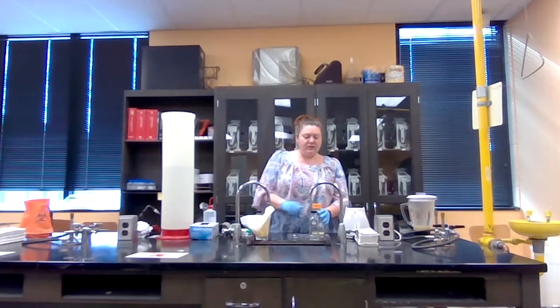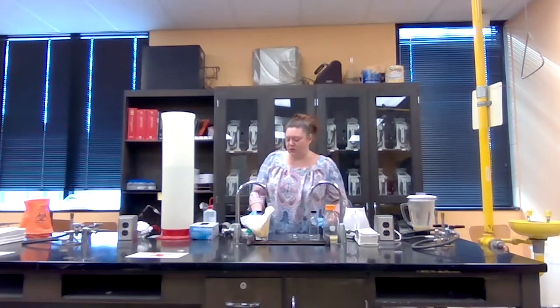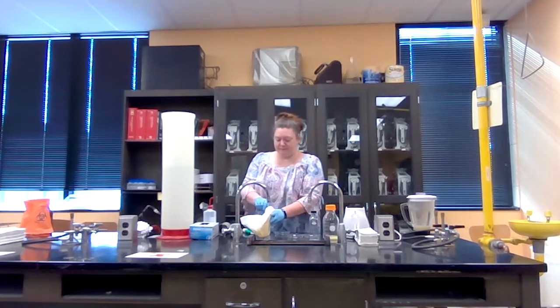And if these dilutions seem a little strange or a little confusing to you, what I'm doing is something called serial dilutions. And you can look up serial dilutions, and I'm sure that you'll be able to find a lot more information about how to make serial dilutions and what they're often used for. Because they are often used for quality assurance in testing for like food or milk or items like that. Water testing, they make serial dilutions.